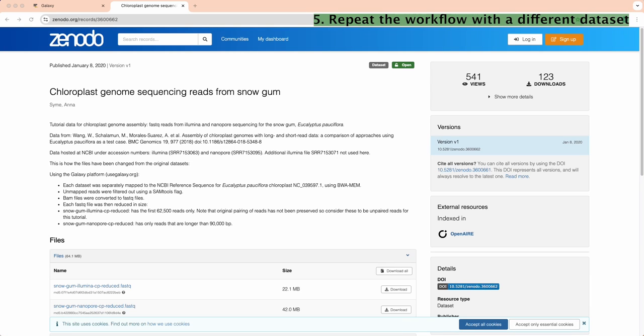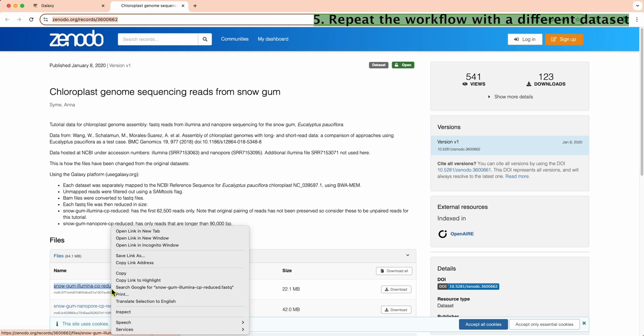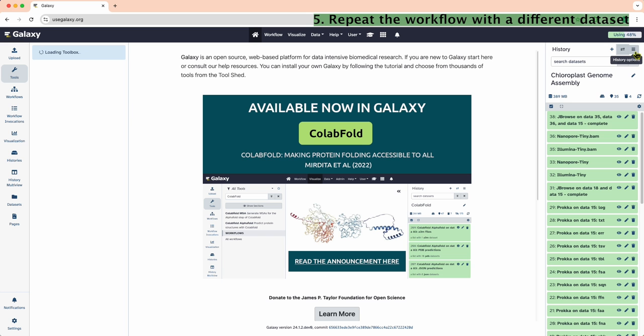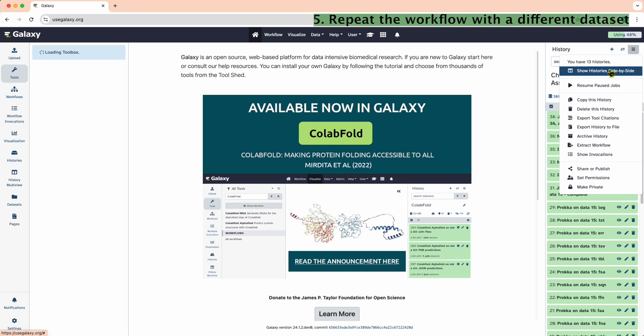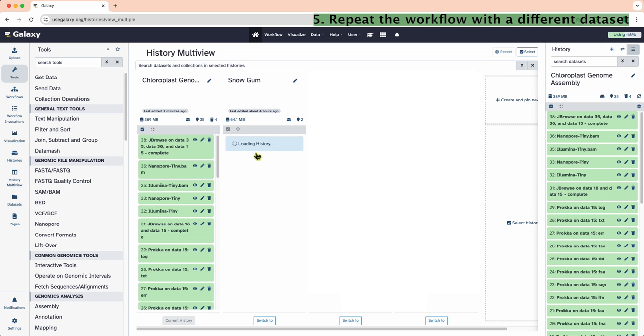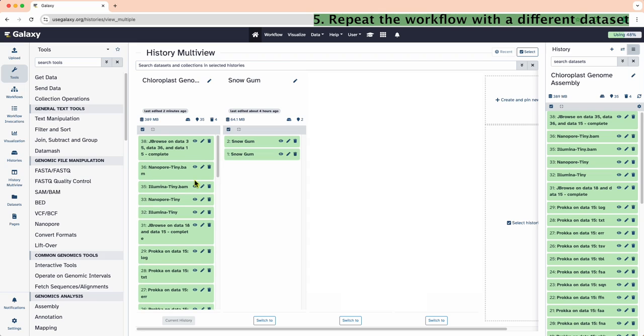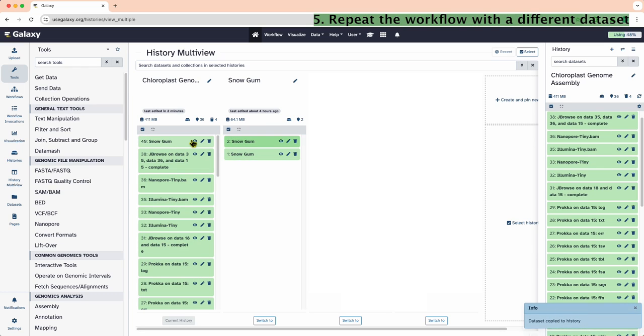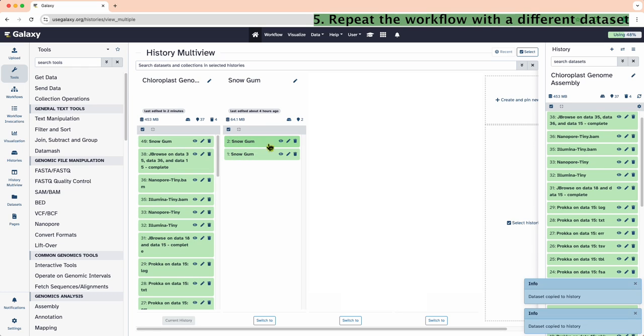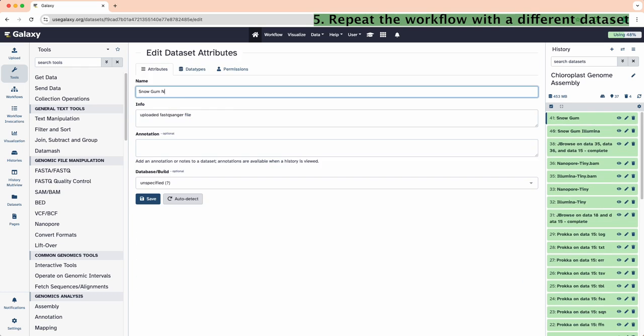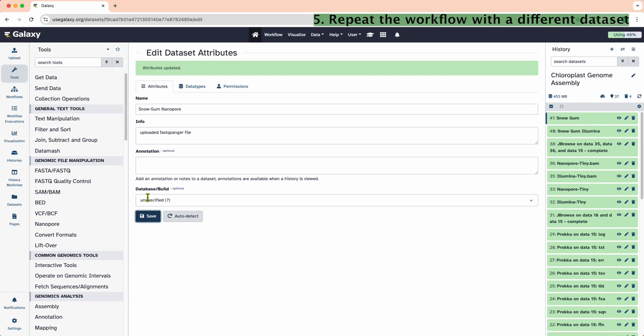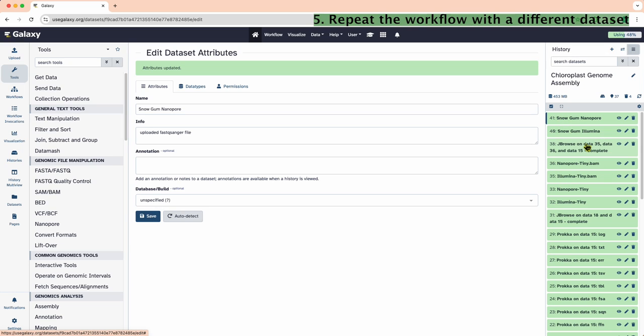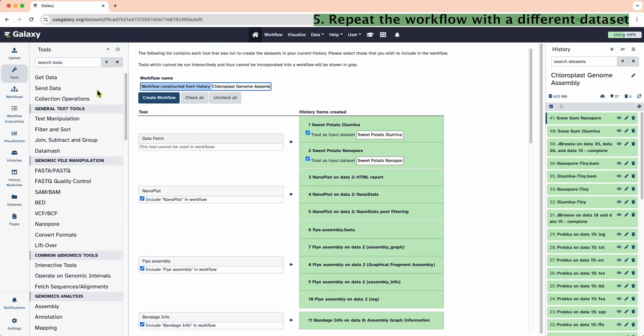If we need to repeat the analysis with a different dataset, here is one way to do it. Let's get the dataset link from Genodo. Upload the data into the history. Update the attributes as we did previously. Next, extract the workflow from our original history. We can make minor tweaks as needed. Click Create Workflow.